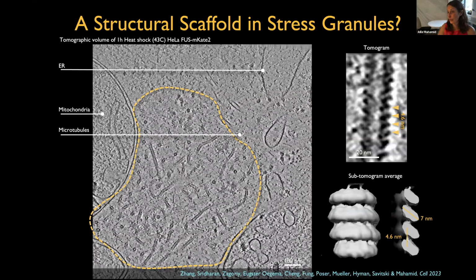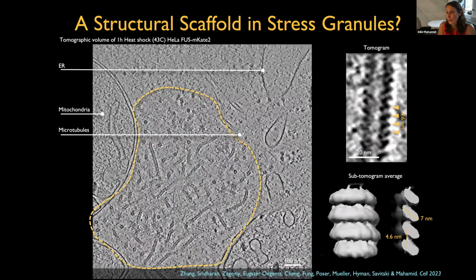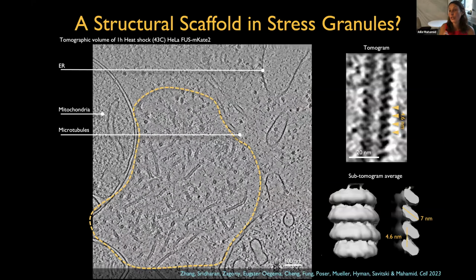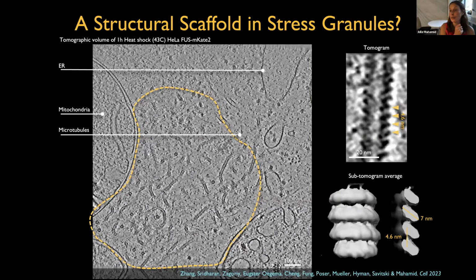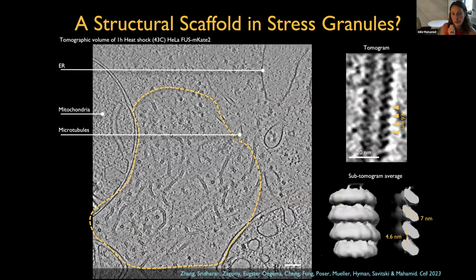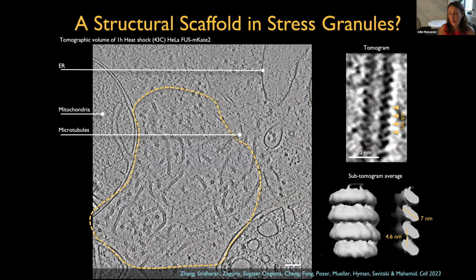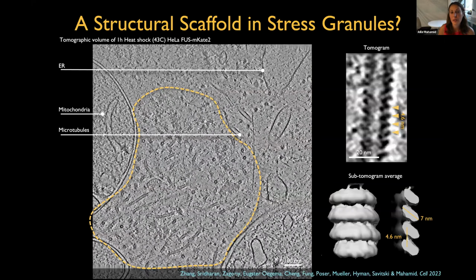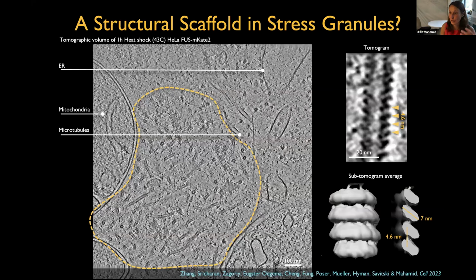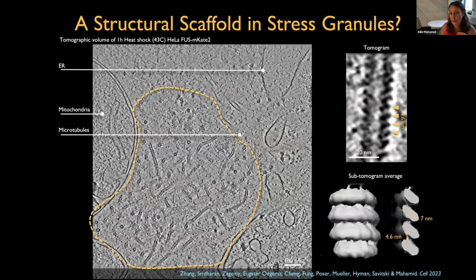And then we subjected these fractions to proteomics analysis based on mass spectrometry. And to our big surprise, for a very long time, we could not identify a single human protein that would explain the gradient density purification that we got for these assemblies. And so we were extremely puzzled for a very long time until we were able to generate new image processing algorithms and apply them now also to helical structures.